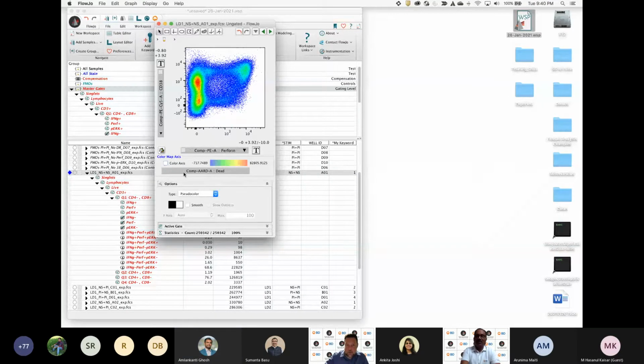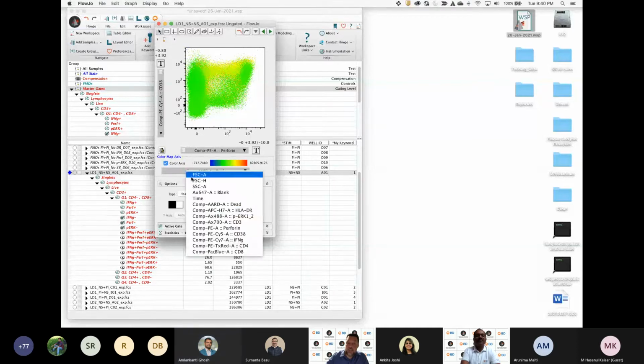Great. Because I too was not very familiar with this one. You're looking at two parameters and looking at the third on the two parameters, right? Right. Yeah, that is quite different. Correct. And you can see if you pick the same color, you can see the scale.